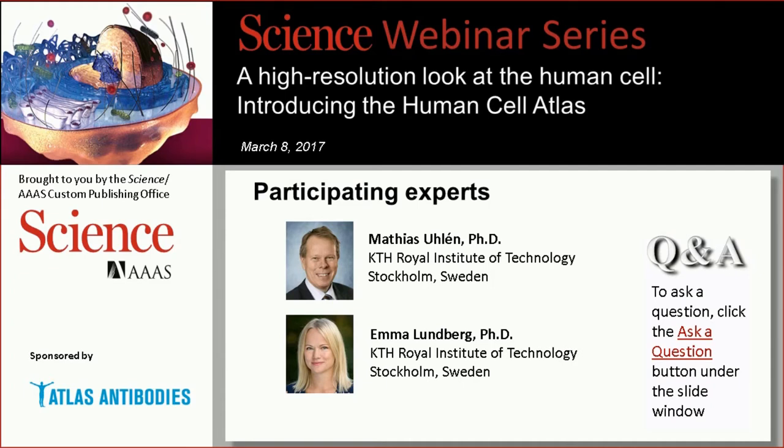Great, thank you. And I believe this question was answered, but I wanted to make sure that the audience knows. This viewer asked how it would be possible, and under what conditions, for instance, price and subscriptions, they would be able to get access to the Human Cell Atlas. But as far as I know, it is completely free for all users. Is that correct? Yes, everything is completely free for all users. You don't even have to register to use the atlas. It's freely available, and you can also download all data.